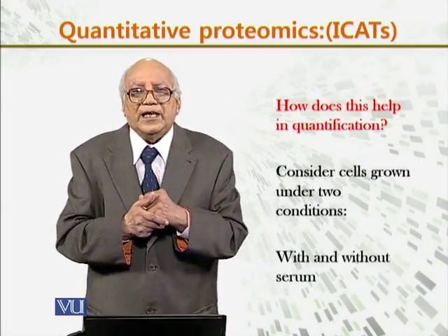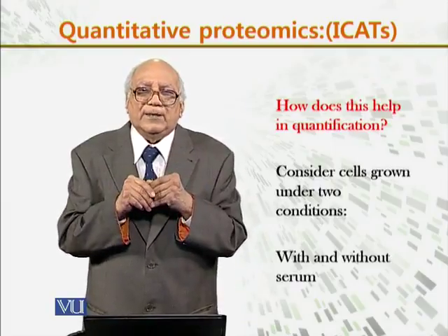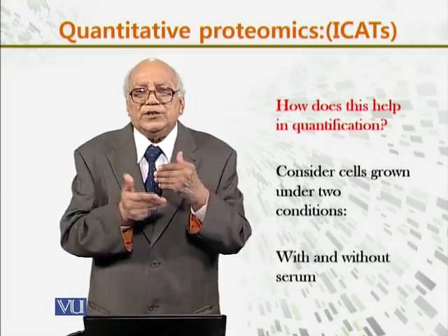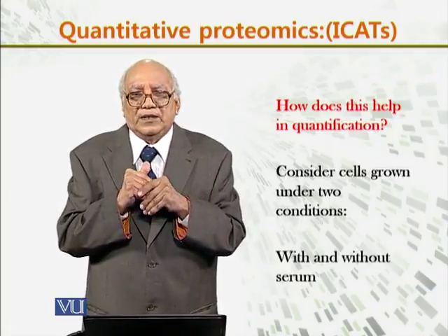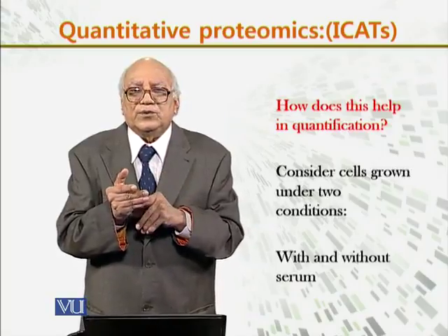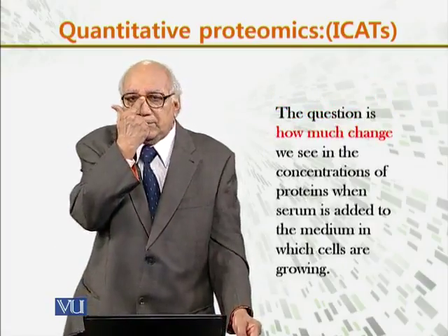Now, how does this help with quantification? How does this tag help to quantify the protein, to quantify the mass of the protein? So, just consider cells grown under 2 conditions: with and without serum. One, the cells are grown with serum, and the other, they are grown without serum.